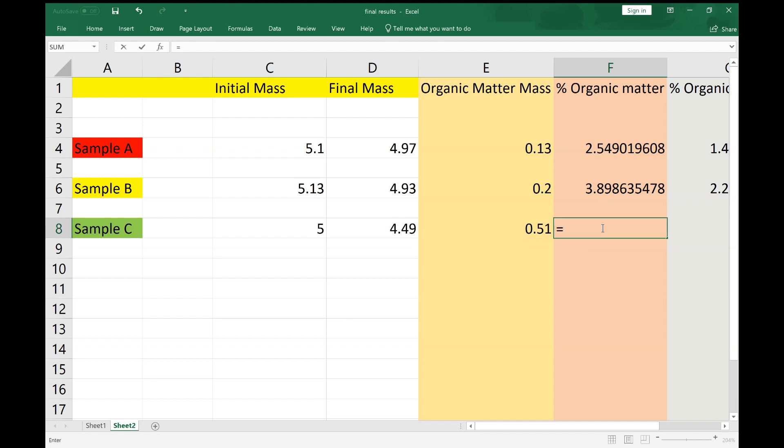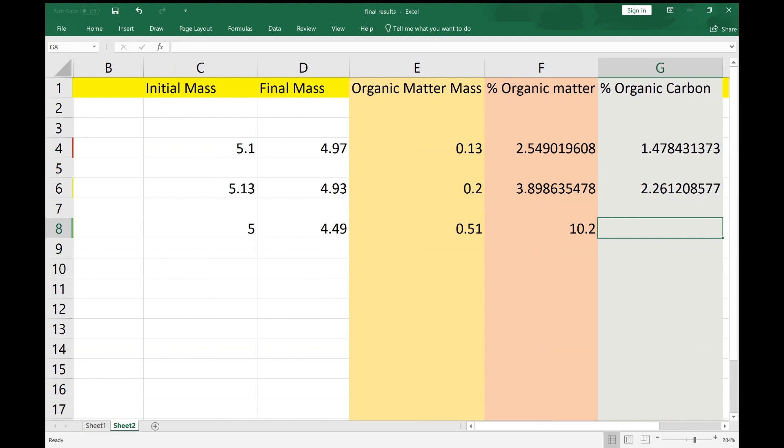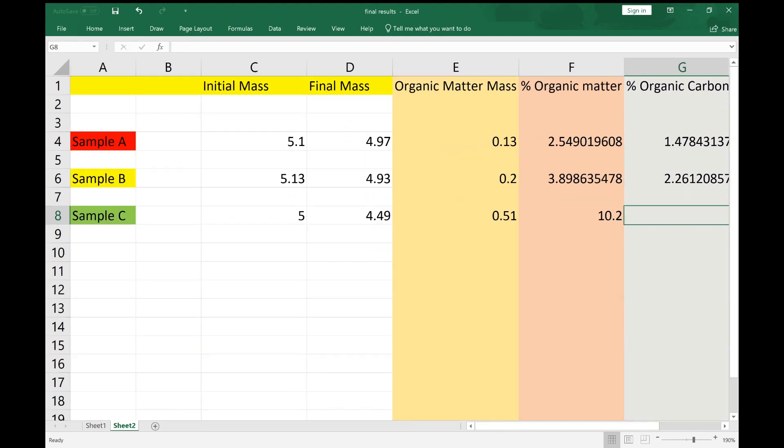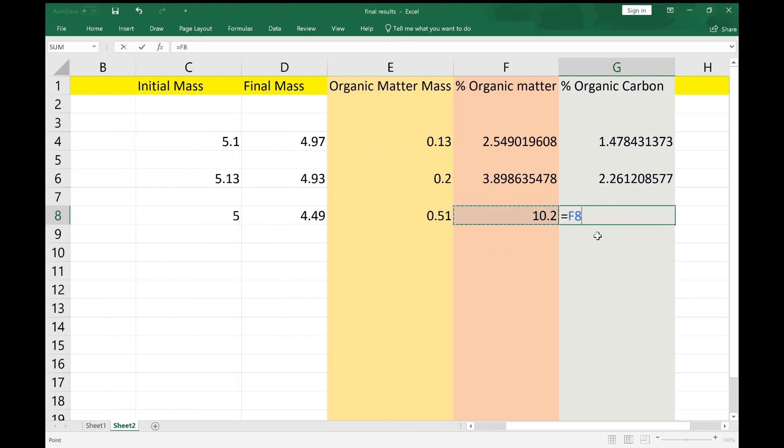And then I'm going to star, which is shift 8, by 100, and that gives me 10.2%. Then if we come over to convert that into percentage organic carbon, organic carbon is 58% of all organic mass. So I take my 10.2, I hit my equal sign again, and I'm going to multiply F8, or 10.2, by 0.58, hit the enter sign, and that gives me 5.916% organic carbon.